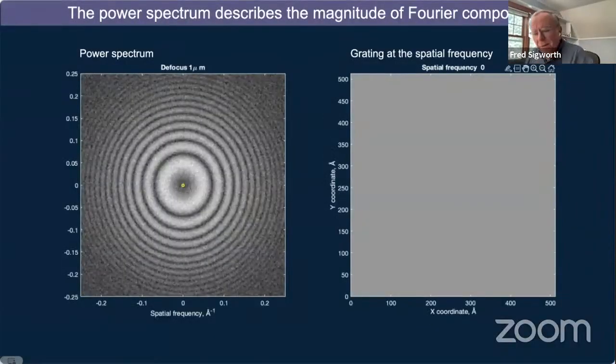Okay, so we can just look at a micrograph and see what the amount of defocus is. And the way we do that is we compute what's called a power spectrum. So if you have a micrograph that has some stuff in it, and you take the power spectrum, which is the magnitude squared of the Fourier transform, what you see is this oscillating bright and dark rings.